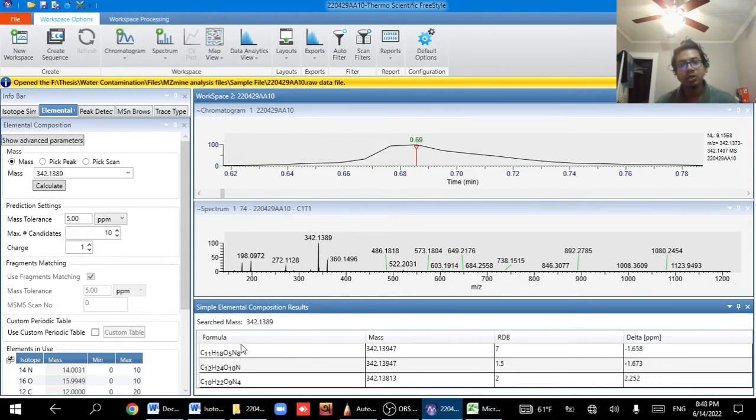Why is it plus? Because remember, when you use ESI, I mean electrospray ionization, we take positive charge and detect the positive charge. That is why this formula is positive, not the exact molecular ion. So this is a charged particle. And remember, in ESI, I need to show you more.